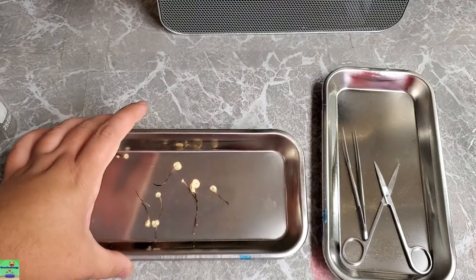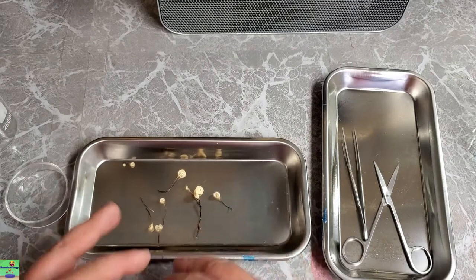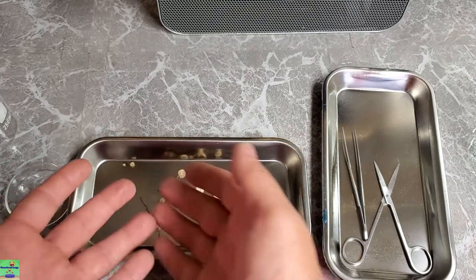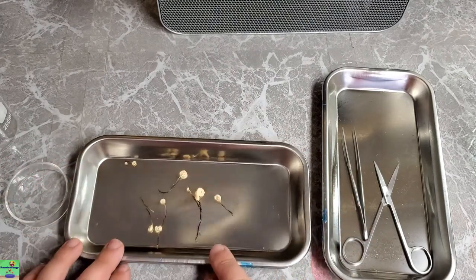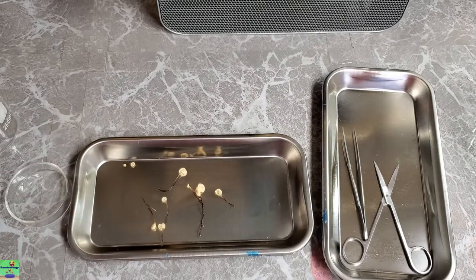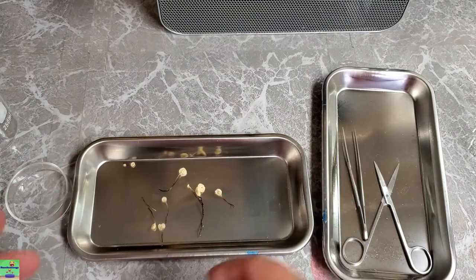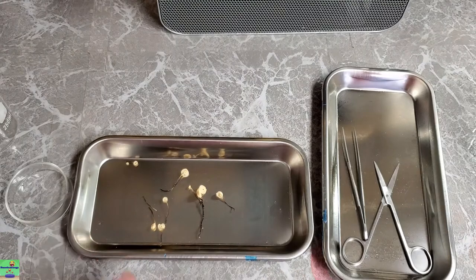Okay, and back in the lab, redneck lab, whatever you want to call it, I do have my little specimens that I acquired in my little nature hike. Now, I'm going to tell you right now, I already did a spore print, so I have something to transition into after I show you how I did this.